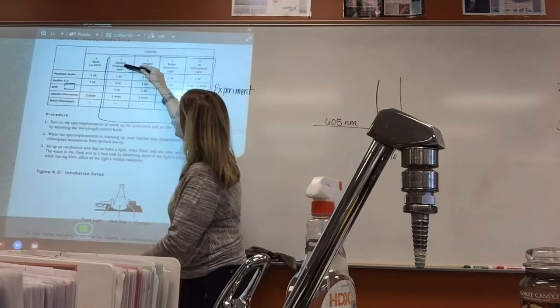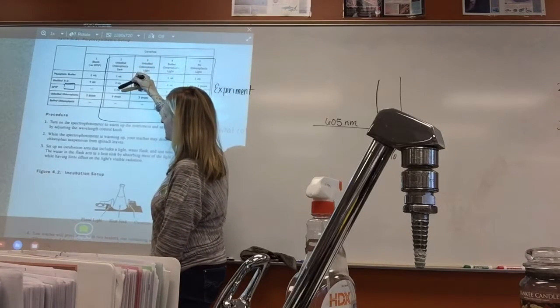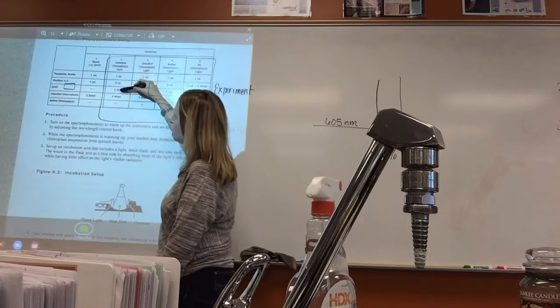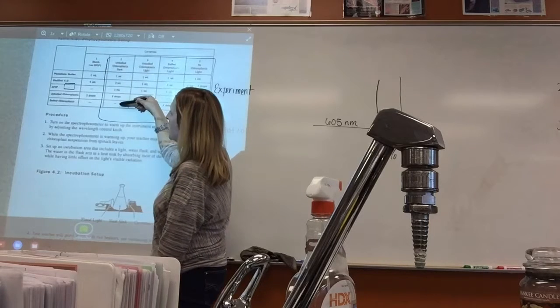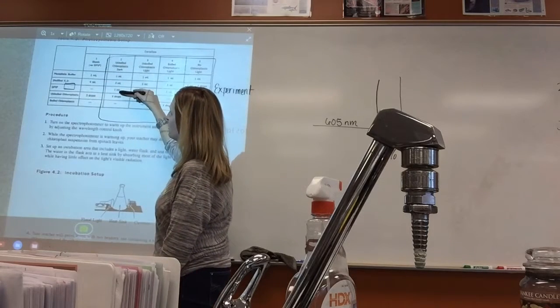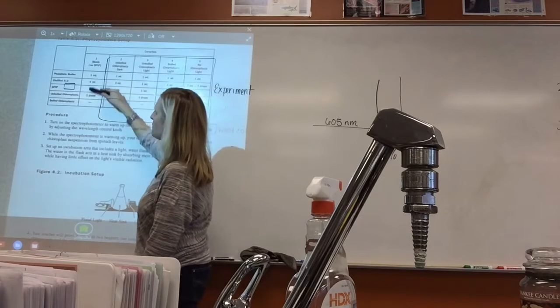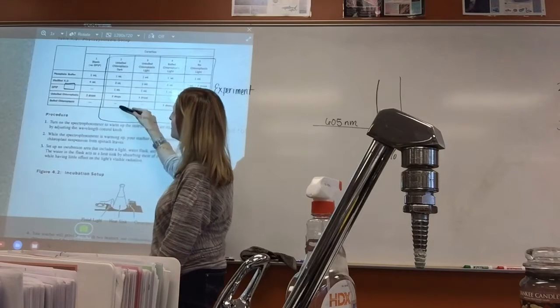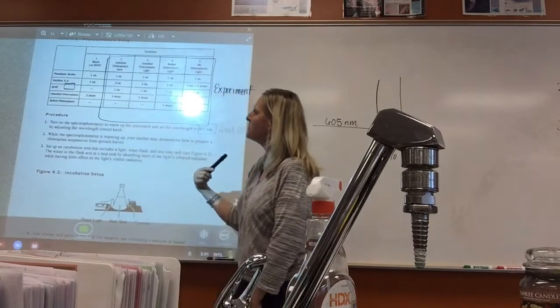If you look at what's in test tube 3, there's the buffer, the 3 milliliters of distilled water, and now we have the 1 milliliter of DPIP. So you notice the difference from the blank: it's the same volume, but the only difference is that this one has DPIP. And so then we zeroed out the machine here, so any change in transmittance over time is due to the change in that DPIP.